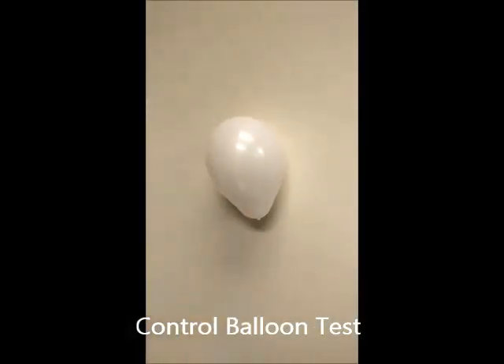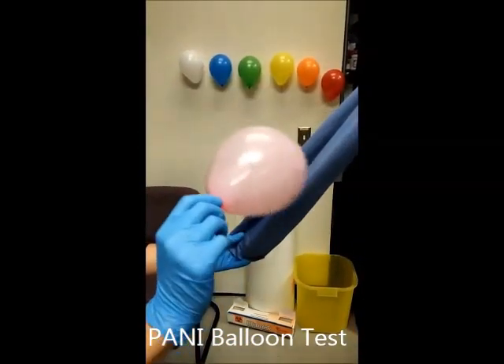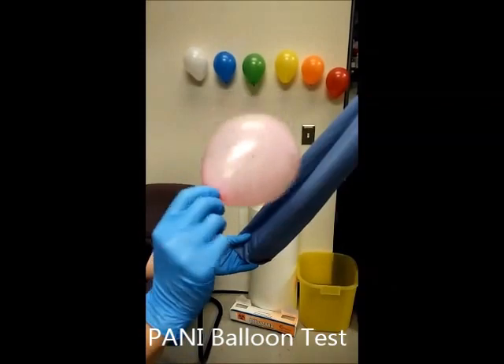This is the control of the water. This is the highly concentrated polyaniline solution.